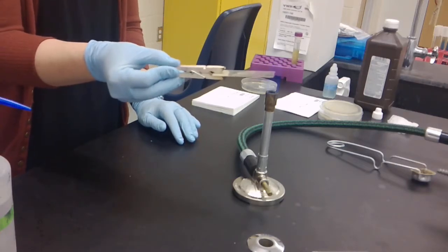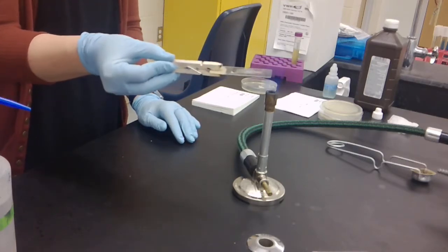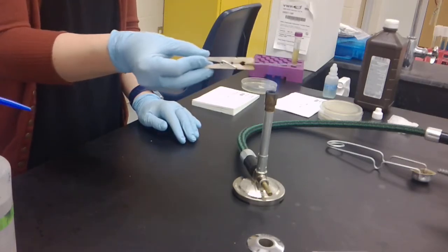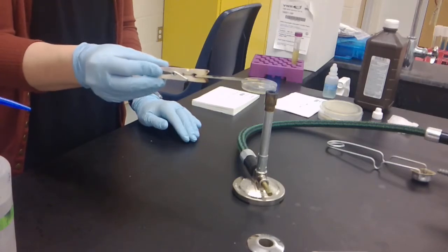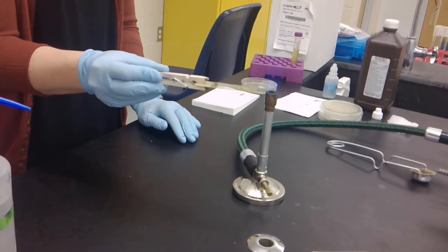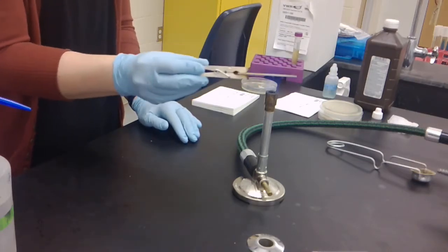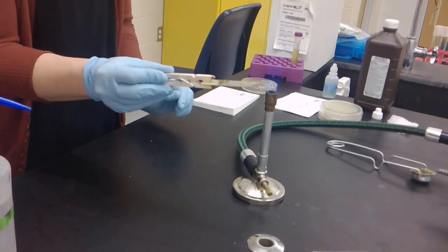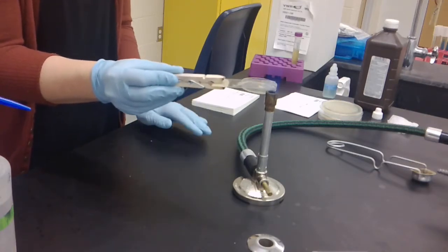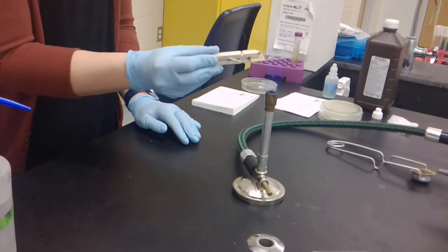If you do happen to break a slide while you are heat fixing bacteria, this is a very common occurrence. Everyone breaks at least one slide a semester. Sometimes people will break multiple slides in one day. If that happens, just let me or your TA know. We will come over and we will immediately clean up that hot glass for you. Please do not touch the hot glass on your own. I do not want you guys to get burned.